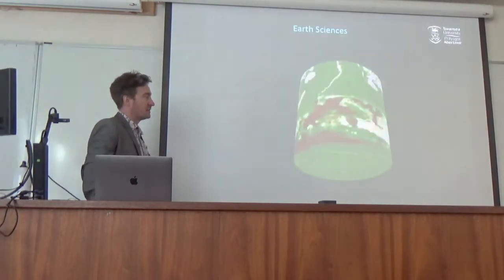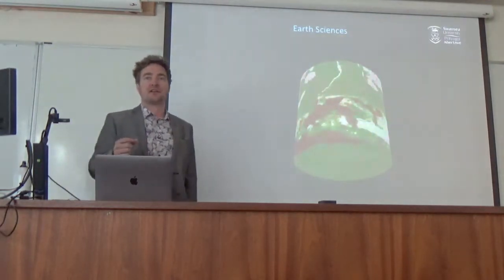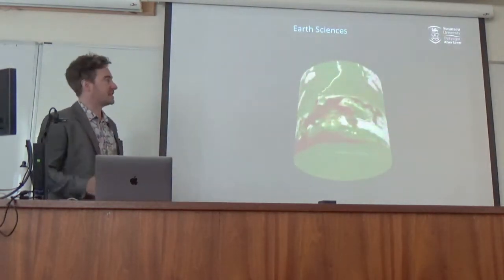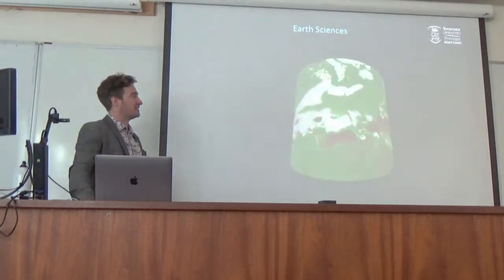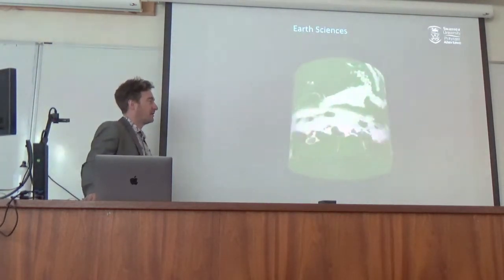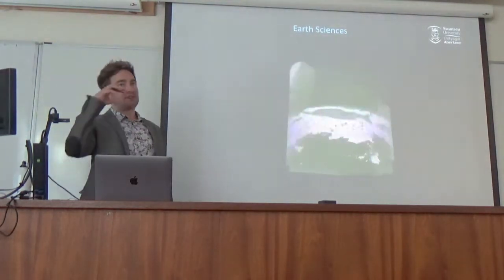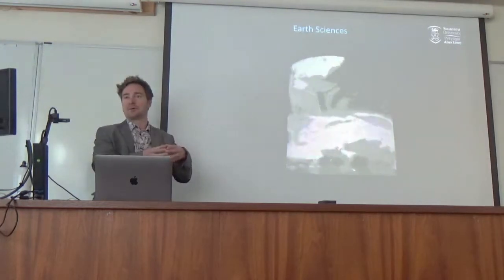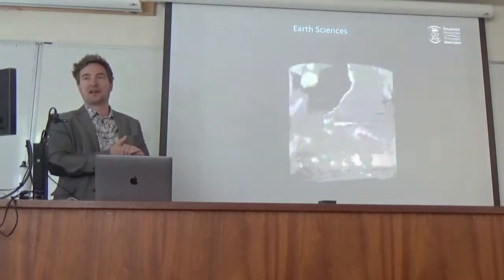In earth sciences, it can be a real challenge to pull apart materials of similar density. So segmentation has traditionally been a challenge with some earth science samples. This is a core sample from a marine environment. That's where people go out on boats, drive a drain pipe into the sediment at the bottom, pull it back up, and then we image that within the X-ray machine.